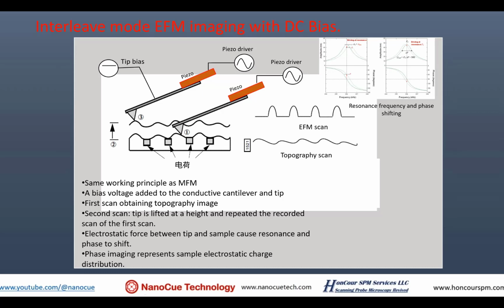So how do we overcome this, detecting a very small attractive or repulsive force with a large amount of noise? People in electrical engineering will understand this principle. The working principle is that it is very hard to detect a small DC signal. However, if your signal is AC, you can detect it much more easily, even in a very noisy environment, using a technology called a lock-in amplifier. A lock-in amplifier will lock onto a particular frequency of signal, and even if the signal to noise level is 1 to a million, it can pick up that particular signal.